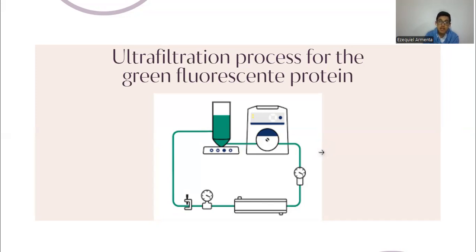weight of approximately 27 kilodaltons. It is also important to ensure that the GFP is fully soluble in a suitable buffer, such as phosphate or Tris at a neutral pH to prevent aggregation or loss during filtration.